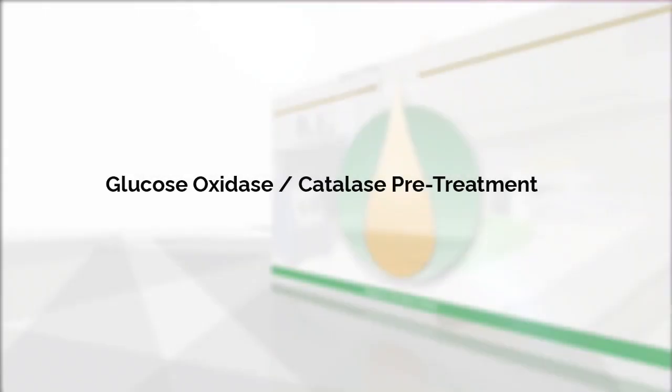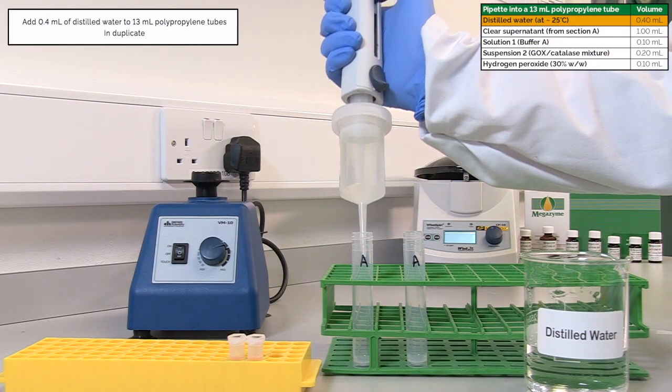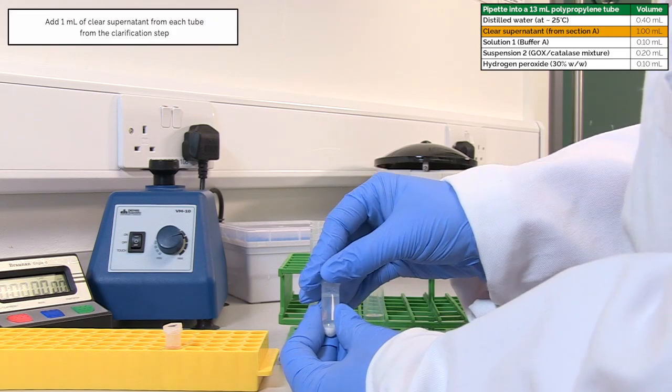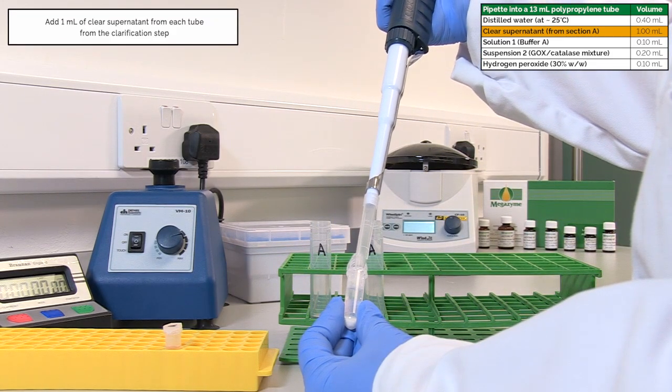Prepare the sample for free D-glucose removal as follows. Add 0.4 ml of distilled water to 13 ml polypropylene tubes in duplicate. Add 1 ml of clear supernatant from each tube from the clarification step.